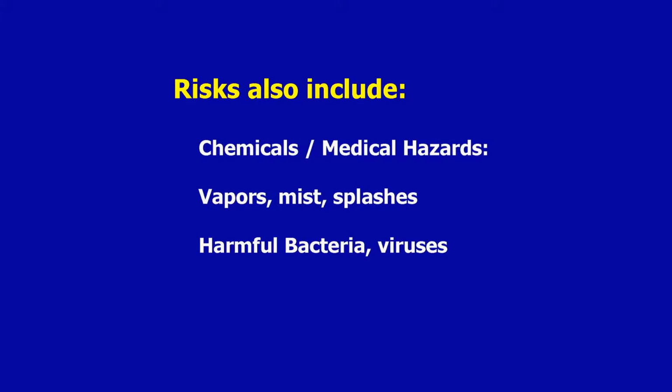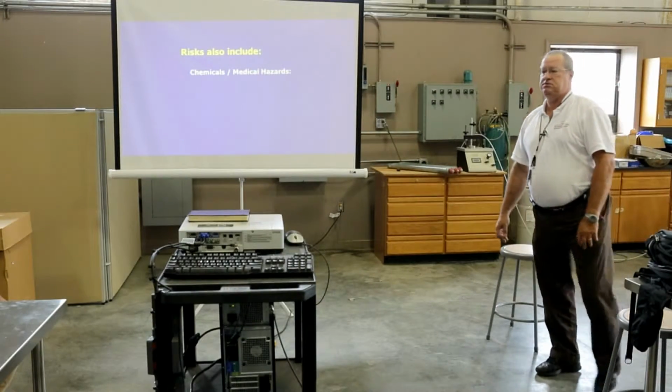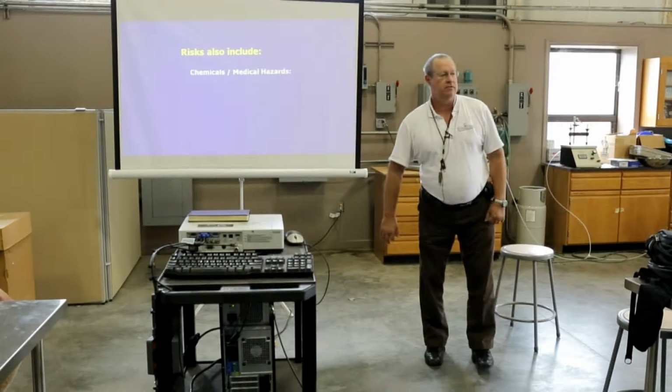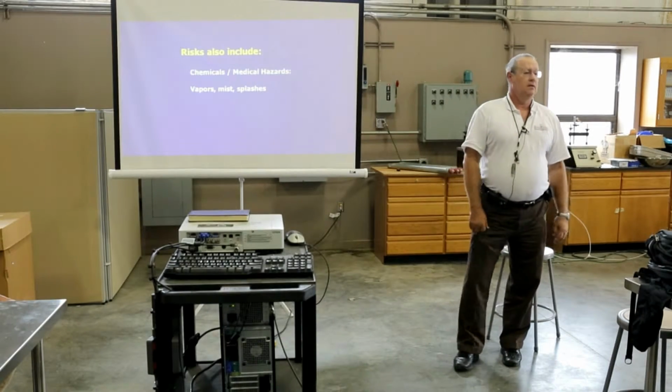Medical hazards? Why would I include that as an eye hazard? We do a lot of research on campus with biological agents. A lot of people on campus have all sorts of mean, nasty things that they're working with. Splash some of those agents in your eye, you can get an infection, whatever that agent might be. That's a route of exposure to develop an illness from that pathogen or agent. So, eye protection is probably a good requirement.